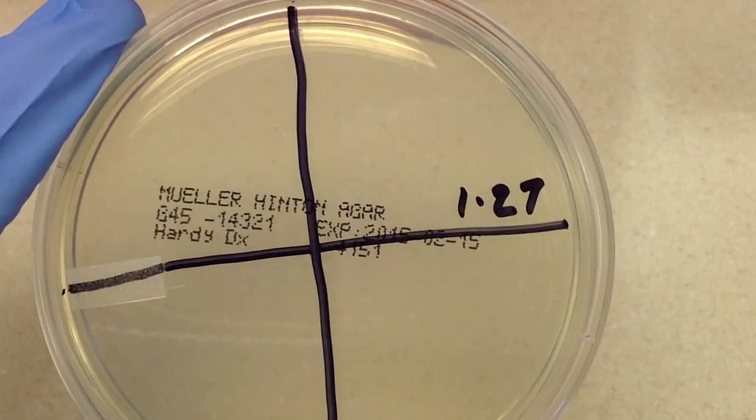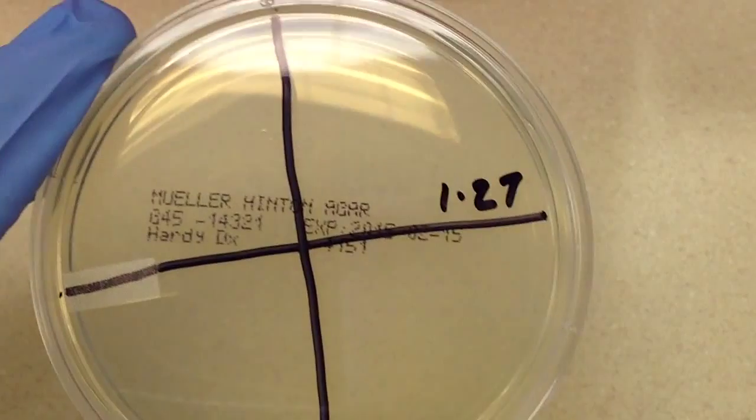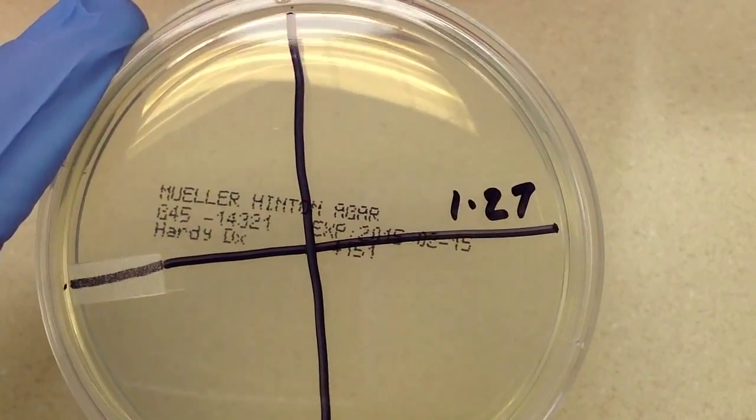I've divided it into four different quadrants. And what's going to happen is I'm going to put a disc in each of these sections except one. One we're going to leave blank.